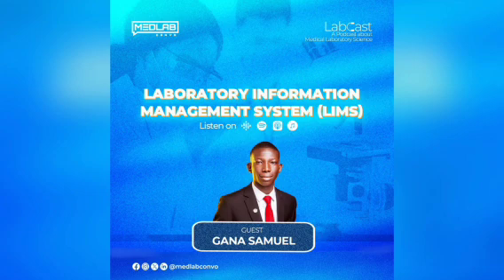In fact, this is better explained using chemistry analyzers, where you run different tests on different samples. The one that is in my head now, is it Sysmex? Yes, I think it's Sysmex. It's able to run different blood chemistry analyses on different samples. So you have one person doing EUCR, another person doing LFT, another person doing a glucose test, another person running a lipid profile, and you are entering this into one machine to do all.